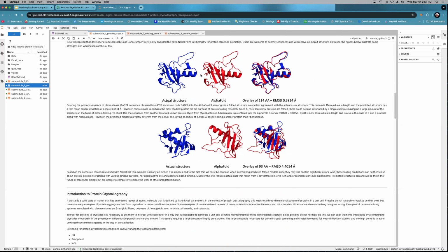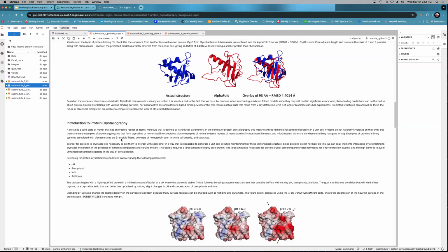So we'll talk about that in the molecular replacement module, but it's still not something that has an answer to everything. And like pretty much everything with AI, it's perfectly fine to use. It's very helpful, but you shouldn't use whole cloth what it puts out. You have to look at that and interpret it, and make sure it makes sense. And I give an example of where AlphaFold did a really good job predicting something and then not a good job predicting something else. This is a small protein that is actually part of that structure that I showed in the beginning of this video.